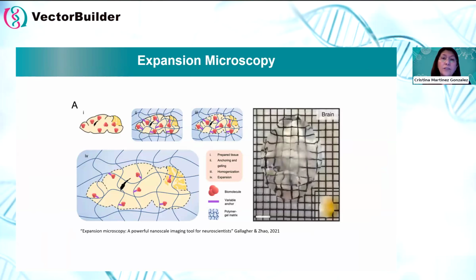And on that note, I know this is not tissue clearing, but based on CLARITY, a very, very similar approach is expansion microscopy, developed by Boyden. It's a very similar principle. And I would like to include expansion microscopy as well in clearing methods because it's embedding the tissue in a hydrogel, but instead of expanding a little bit, you can expand loads more, and you do have very little protein loss with this approach. You can expand your structure between 4 times to 25 times.